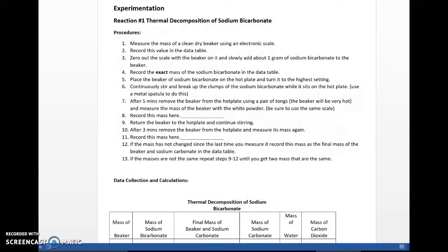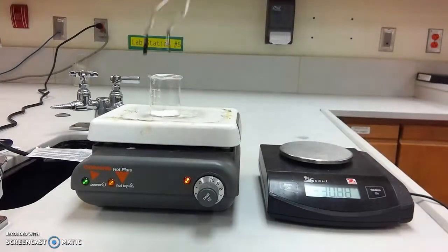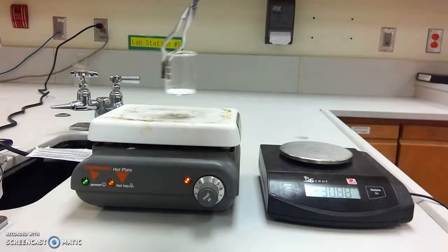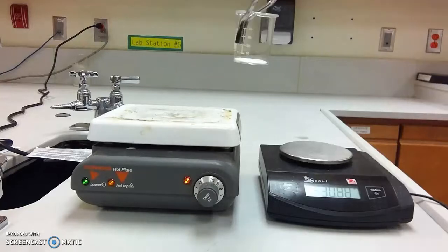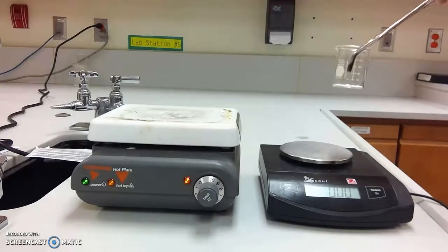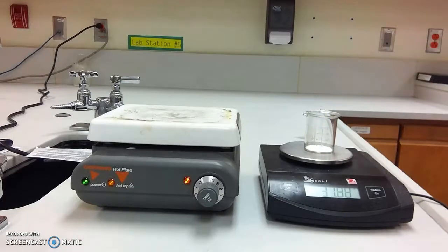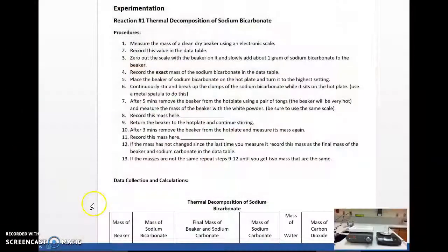All right, so it's been about five minutes, so now I want to go ahead and remove this from here. Notice I'm using a pair of tongs. I'm not going to use my fingers. It's going to be very, very hot. Zero out the balance and measure the mass of the beaker and the white powder inside. I'm going to record that mass right here in my procedures.